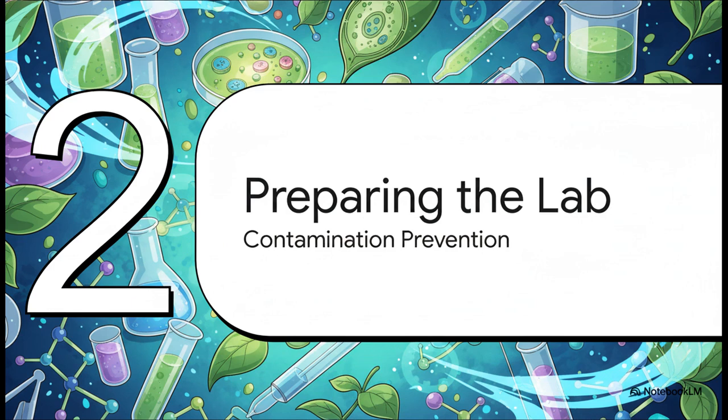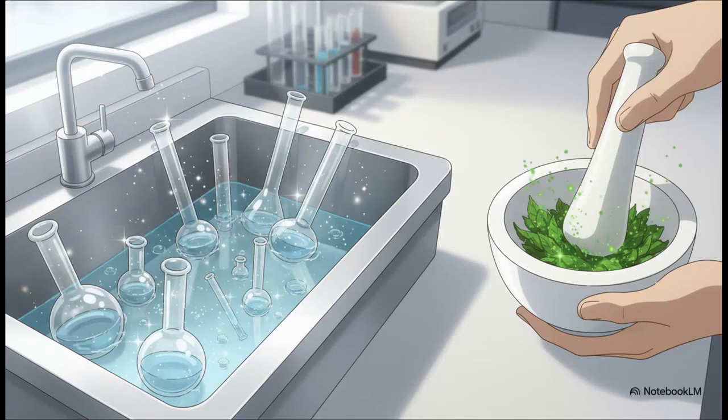All right, Section 2, Preparing the Lab. Listen, the absolute most crucial point here is that in trace mineral analysis, cleanliness is literally everything. A single speck of dust can totally ruin your data. So we start by acid washing all of our glassware, soaking it overnight in 10% nitric acid, rinsing it 3 times with ultra-pure water, and then drying it in an oven at 70 degrees Celsius.